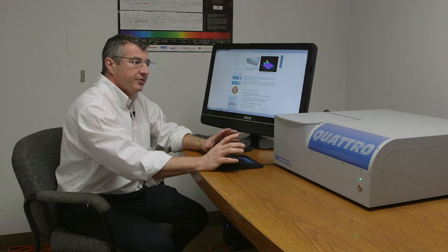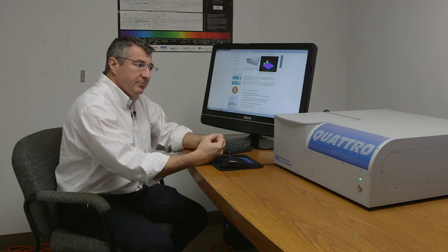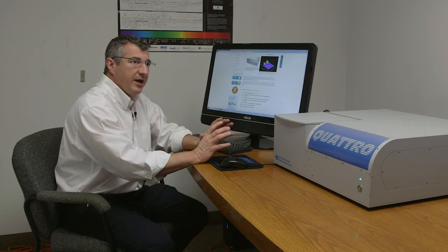Key features of the Quattro spectrofluorometer. Firstly it's the most sensitive spectrofluorometer in its class. It is able to measure down to about five femtomolar fluorescein and that's just a number that really is not attainable typically with an integrated benchtop fluorometer. You really have to get a very large modular research fluorometer to achieve that level of sensitivity. However we're able to do that with the Quattro.